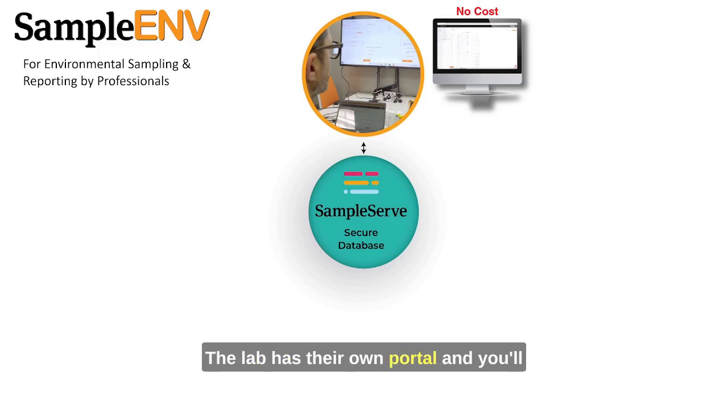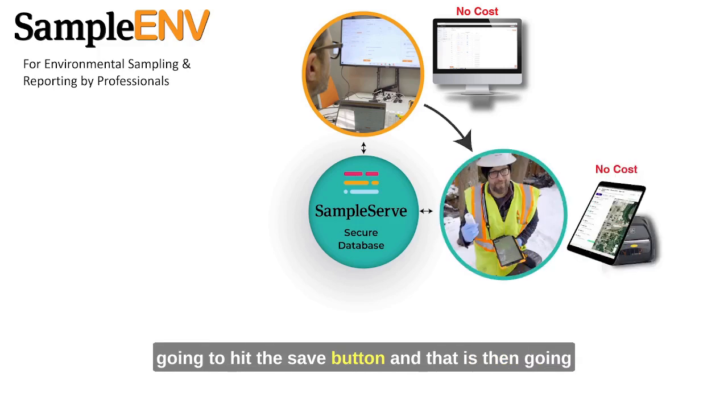The lab has their own portal, and you'll be able to match and connect to them. You can pull down their sample bottles. Then you're going to set up your sample schedules, what you're going to sample for, where, when you're going to sample. It all gets set up here, and once you have that all set up in here, you're going to hit the Save button. And that is then going to push the scope of work that you developed for that particular sampling project to our mobile field app.